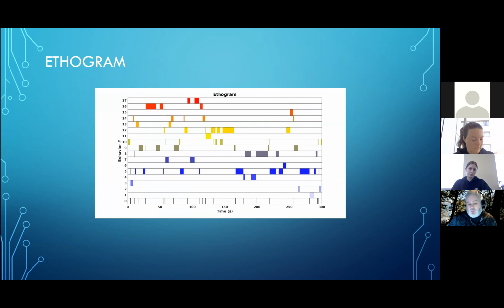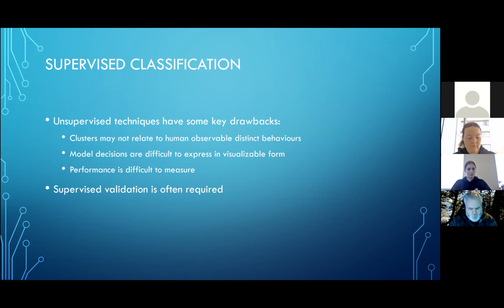And if you like, you can then transform this into an ethogram or other behavioral display, if you want a way to visualize behavior through time. There are all sorts of useful things that can be done. But in this last minute or so, I do want to mention that there are some significant drawbacks to this unsupervised approach to behavioral classification.